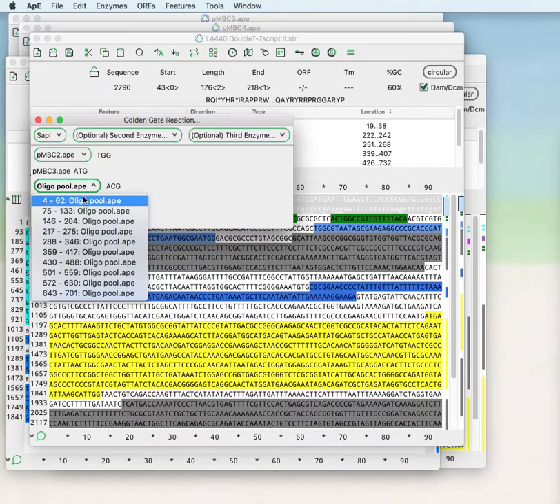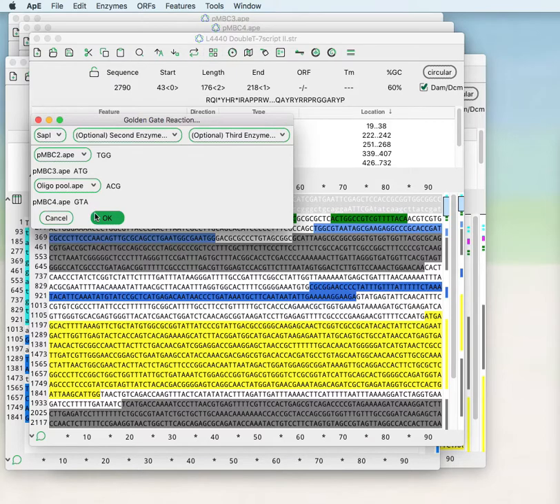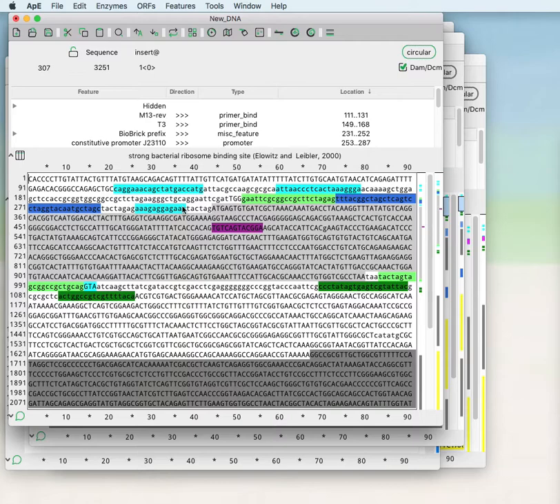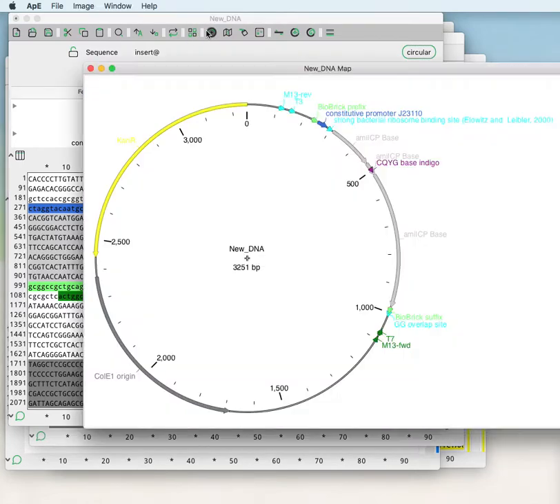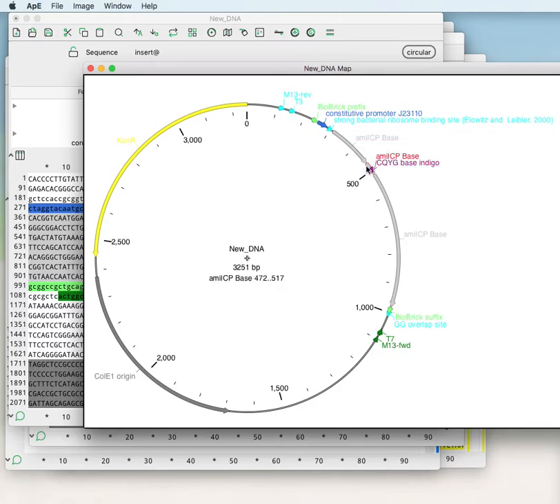So we can generate, for example, the product when oligo one is inserted. And you can see that now there is a new sequence generated that has a different sequence here in the middle of this coding region.